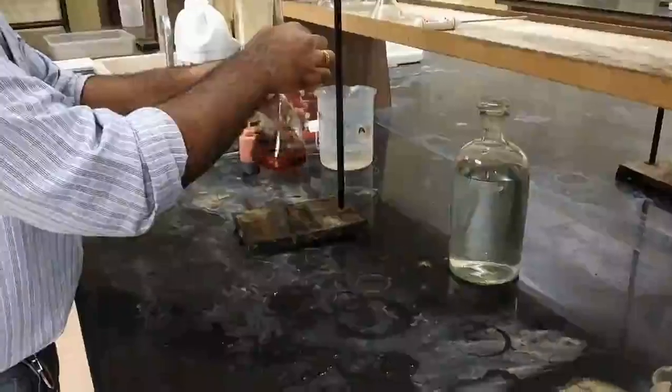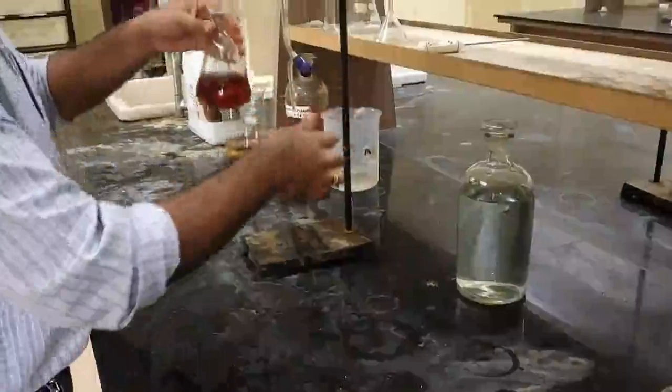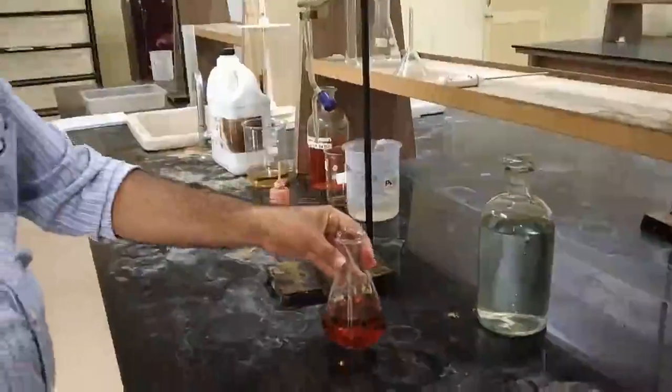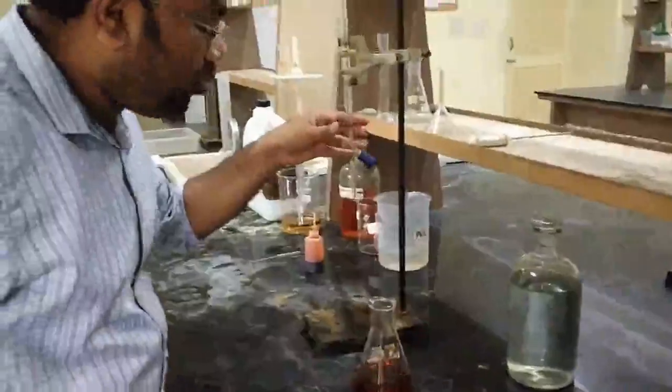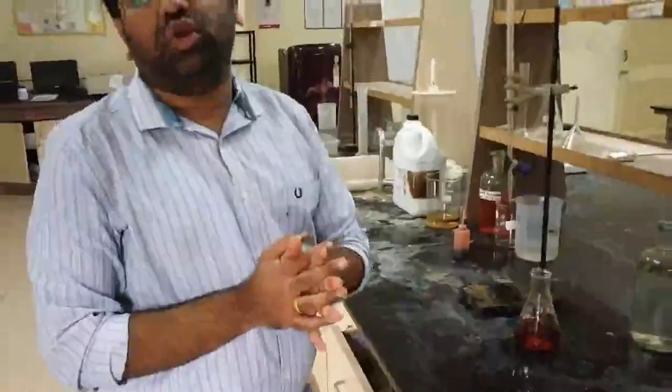for the correction. And the reading that we have obtained, so this is the final color that we have obtained, and the reading that we have got is 24.8. So this reading will be further used for the calculation of the normality.